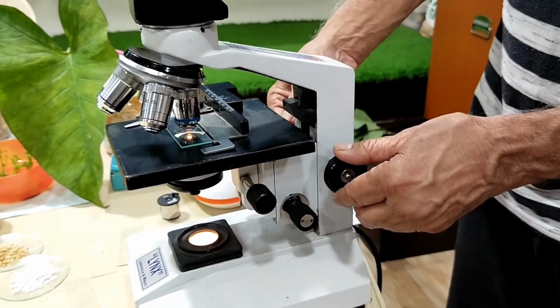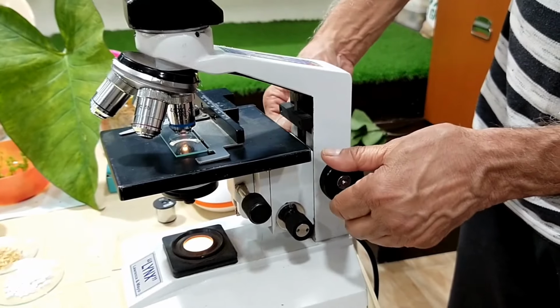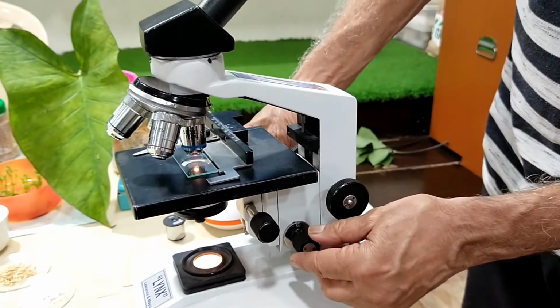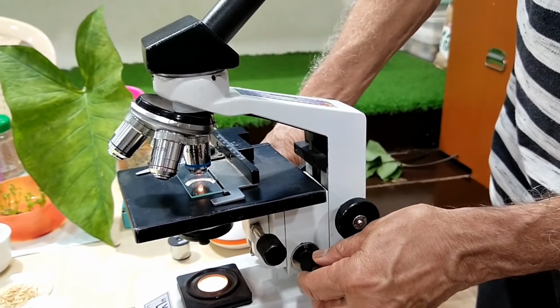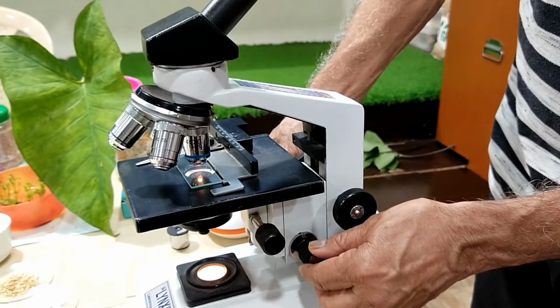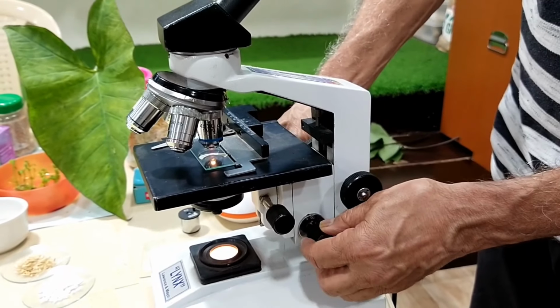Once again, this is coarse adjustment. You can very easily appreciate the movement of the stage. But this is fine adjustment. Even through this, the stage is moving, but through a very small distance, through millimeters, so you are not able to perceive it easily, but it is moving.